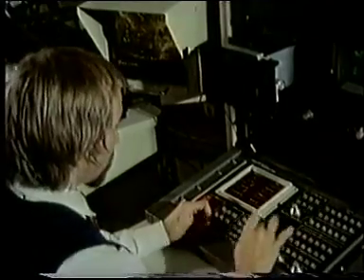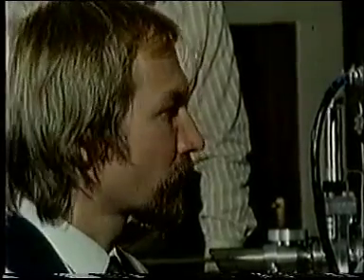The area we'll study is selected using a built-in electron microscope. Now the instrument is switched to its Auger spectrometer mode. Here again is the area we're going to analyze.